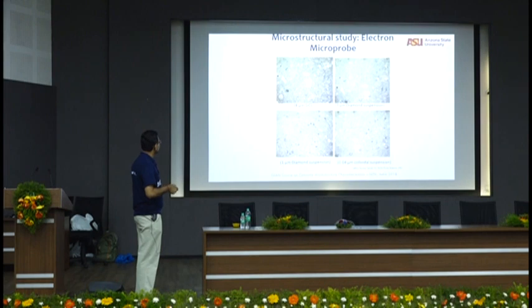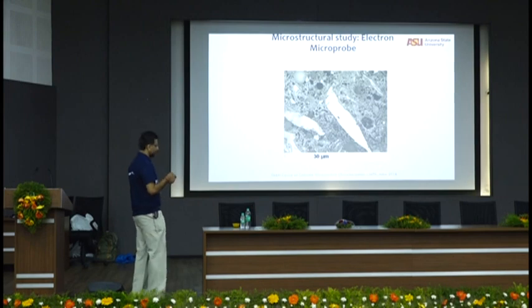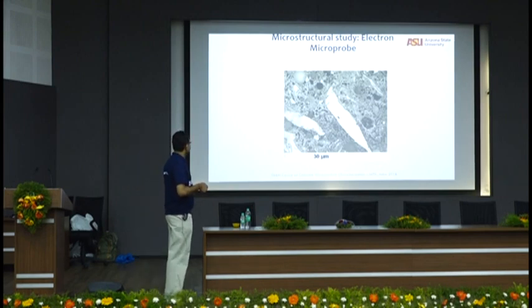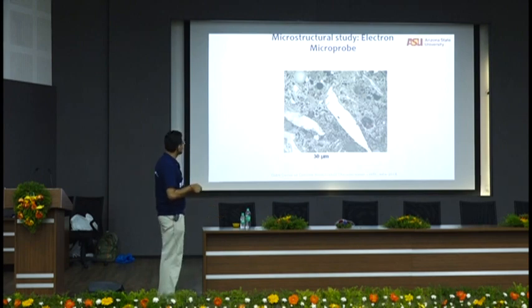Here are the samples after doing 8 micron silica. You can see some rough edges. 3 micron diamond suspension, some more rough places. By the time 0.04 micron colloidal silica, really nice and smooth surface. So here is a sample with the densest particle in the system. You see that's not cement, that is an iron particle. You see why it's really bright, because iron is very dense, right? Density of iron. And then you have some pores.